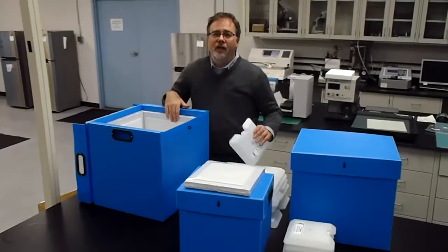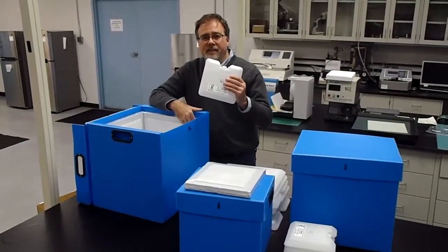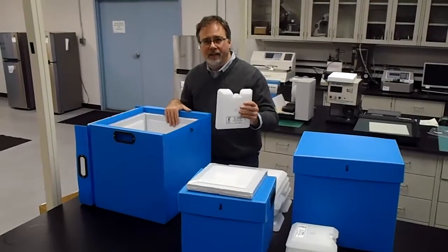A set of six phase change panels comes with each of the shippers. This is the one that's used inside the 6-inch IDQ capacity container.